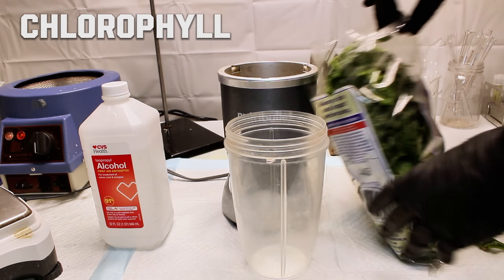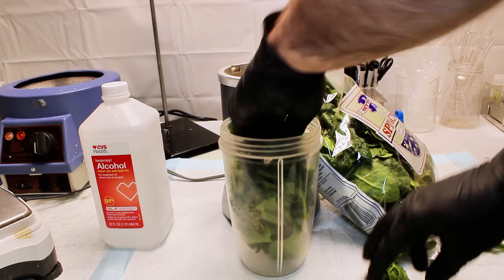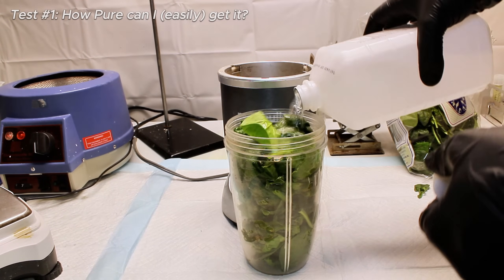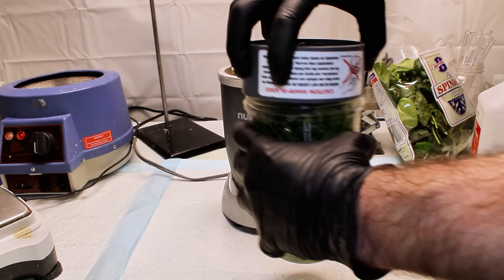Chlorophyll is arguably one of the most important molecules in the world, and so I felt it only fair to see what kind of chemistry I could do with it. Naturally, the first thing I decided to do was to try and isolate some fairly pure chlorophyll, and to get started I went ahead and blended some spinach leaves in isopropyl alcohol.